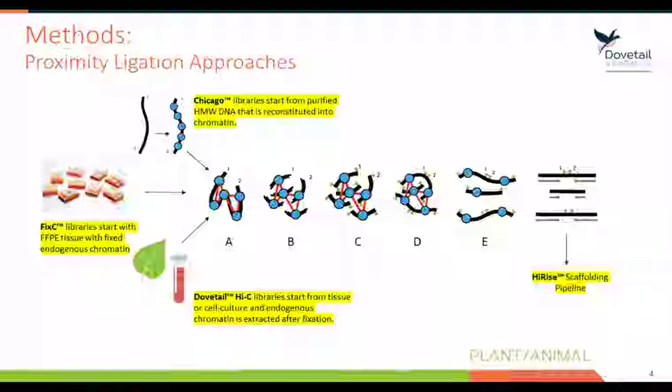In step E, we release those crosslinks, and now we have all of these proximity events floating around in solution. You can see that in our example here, 2 of these proximity events are of real interest to us, the top and bottom, because those 2 represent internal ligation events. The middle one is not of interest because no internal event occurred. So we'll just ignore that middle one.